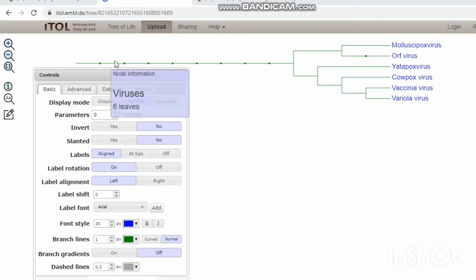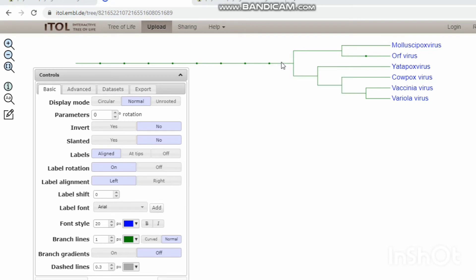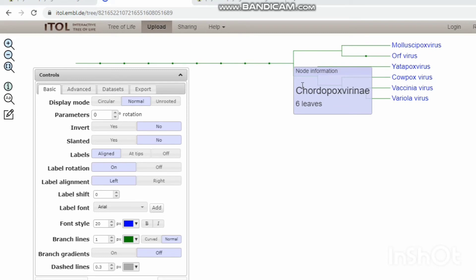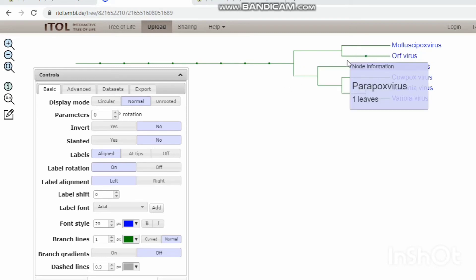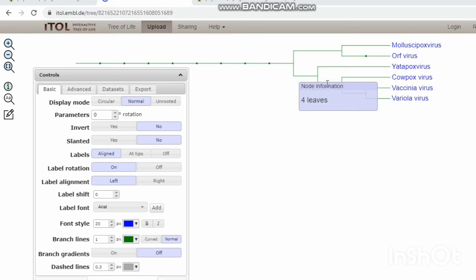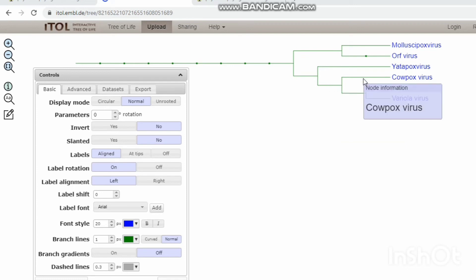The tree has five clusters. The first root node is virus, classified into nucleocytoplasmic viruses. The poxviruses are classified into Chordopoxvirinae, having two-leaf and four-leaf clusters. Under the Parapoxvirus, and within the four-leaf cluster there is Yatapoxvirus under Orthopoxvirus. Orthopoxvirus has three leaves: cowpox virus, variola virus, and vaccinia virus.